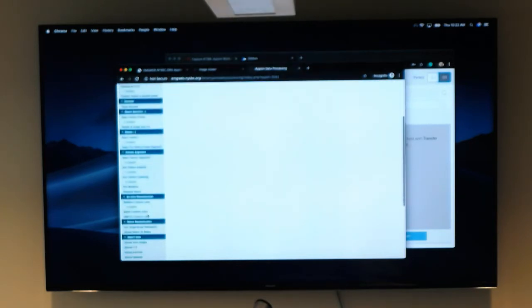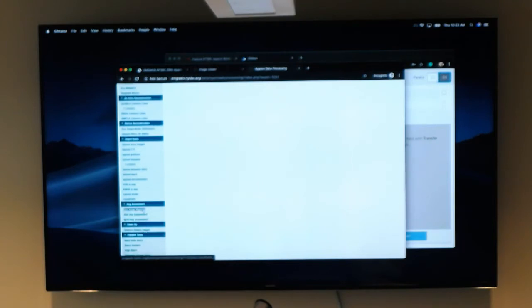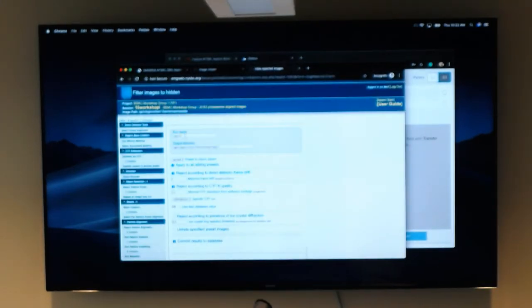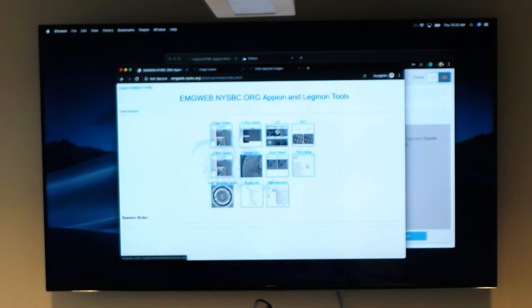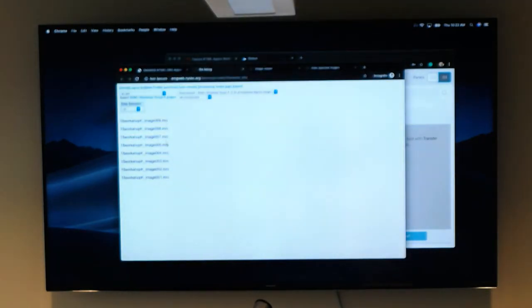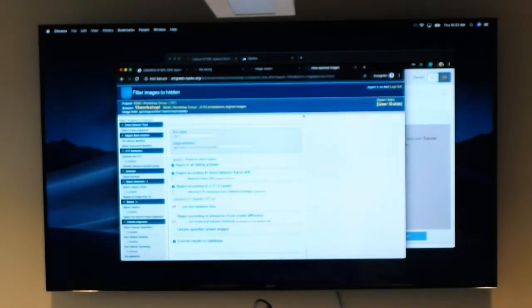To refresh your memory, there are features, for example, image rejector, where you can reject images based upon drift, CTF fit, if there's ice rings, etc., and then you can go in and have basically a list file of images that you want to process or not. Another way would be if you just output a star file with the correct information that you made use of, and there's a way to do that.